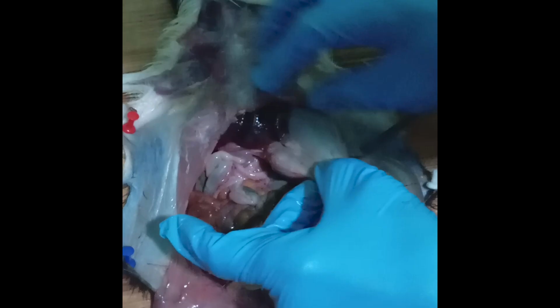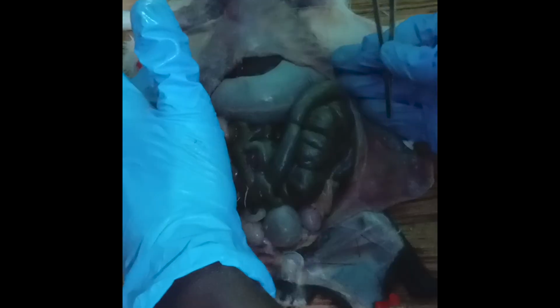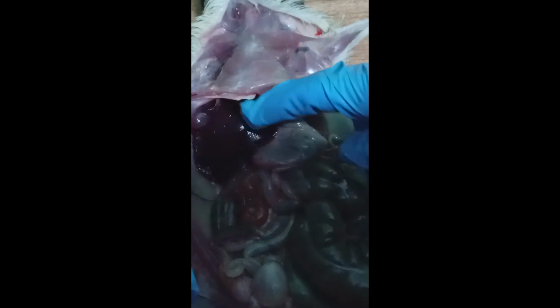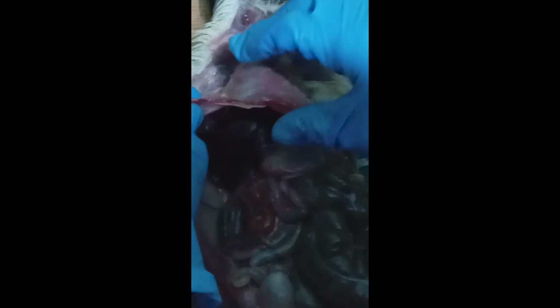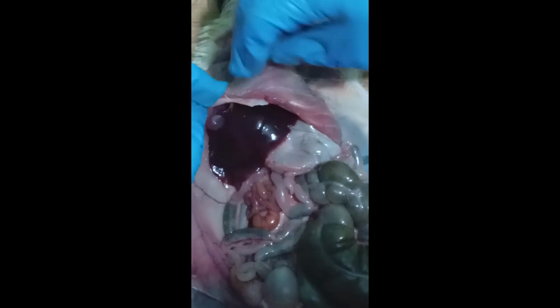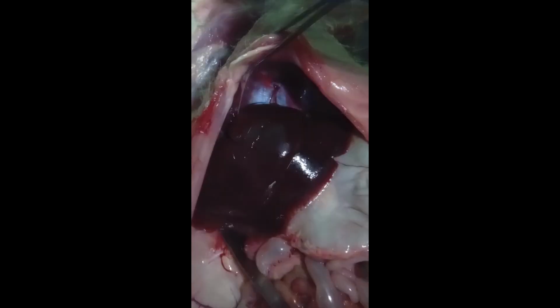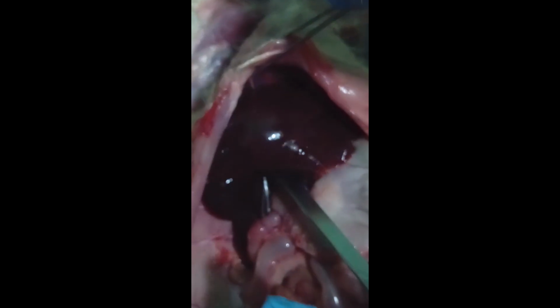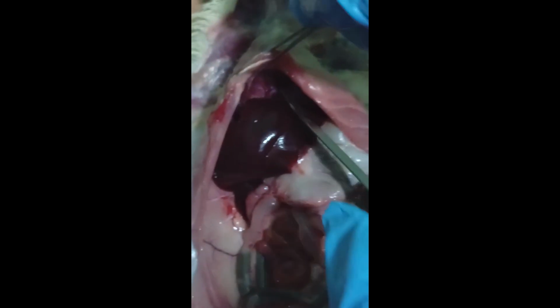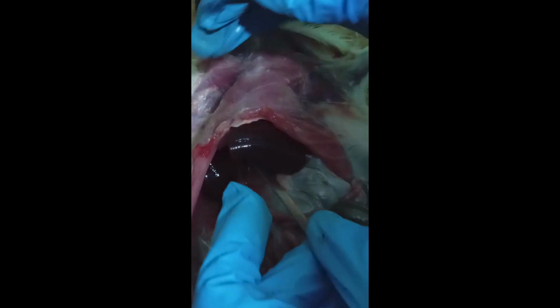And if you want to see the diaphragm, you have to shift the gut a bit and then raise the thorax where the liver lobes are. Raise the thorax. Here's the diaphragm appearing. You see that shiny structure there? That's the diaphragm at the posterior boundary of the thorax, with the liver lobes lying softly on the diaphragm. So here's the diaphragm. The thorax is not opened.